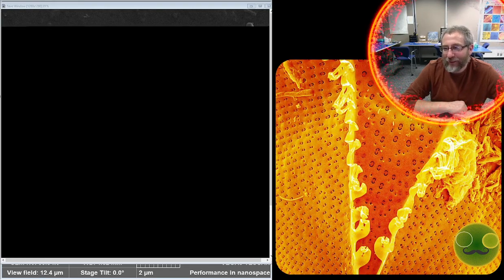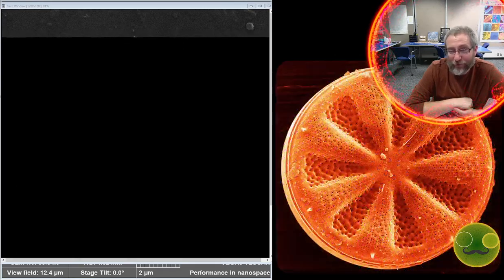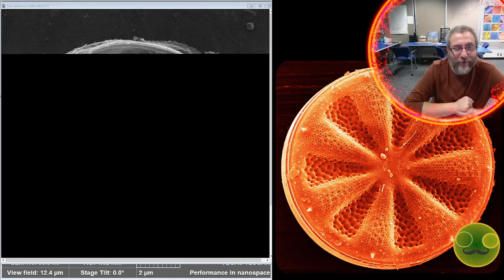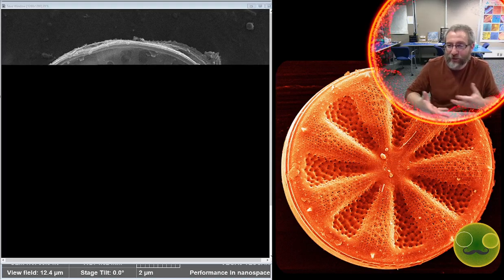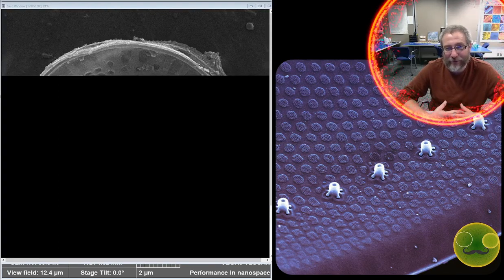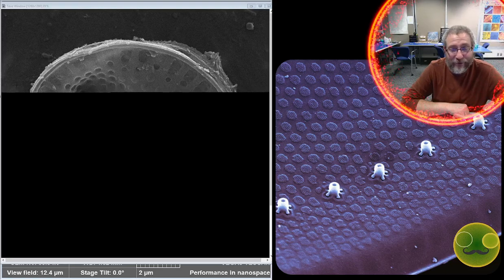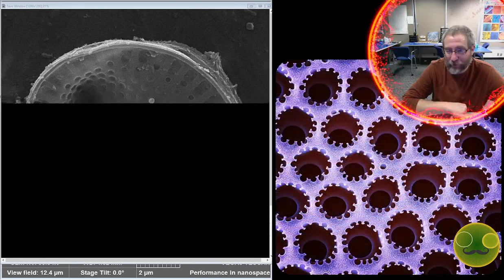Patience is overrated. What is diatomite used for? It's a good question, cyanophyte. People use diatomite for a lot of different things. Probably the first thing out of their mouth, if you ask a diatomist what they use diatomite for, is usually going to be, it's a filter. It's a bunch of little lacy structures. And so people use it to filter things like beer and wine, and that's usually the end of the diatomist's interest in what else people might use diatomite for. So it's used as a filter for sure. It's also used for pool filters, so like a swimming pool filter, all fun things.